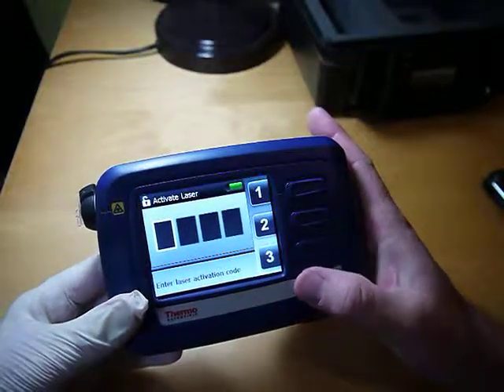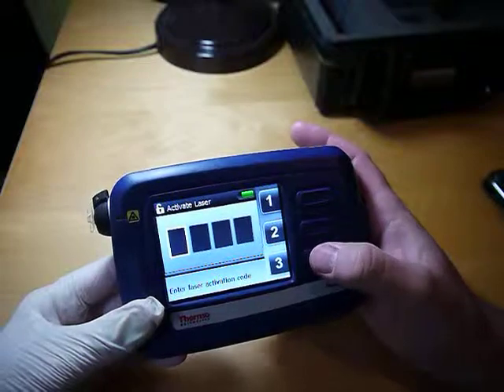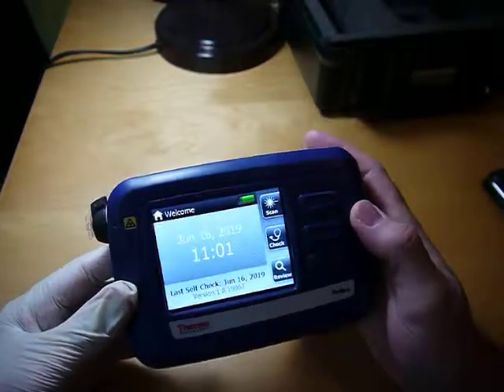When it comes up, there's a code to make sure that whoever's using it knows what they're doing — basically, that they've been trained on it. So I'll enter that code in.